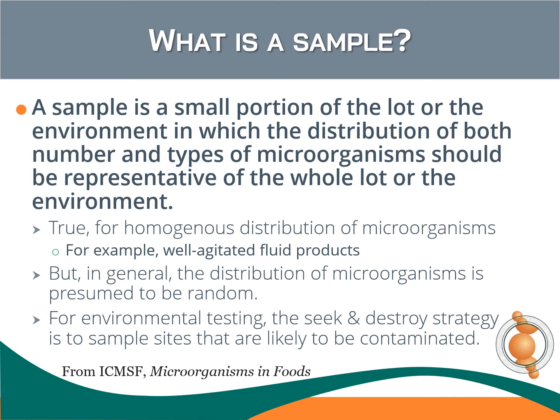But in general, the distribution of microorganisms is presumed to be random. In nature, the microorganism distribution is often heterogeneous. For environmental testing, the seek and destroy strategy indicates to sample the sites that are likely to be contaminated.